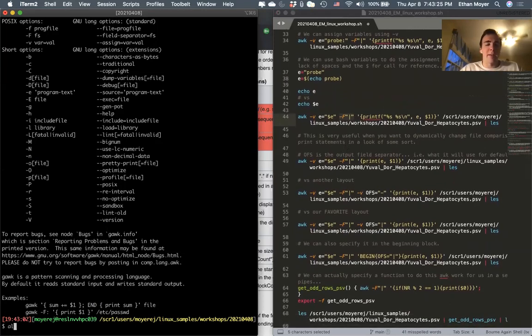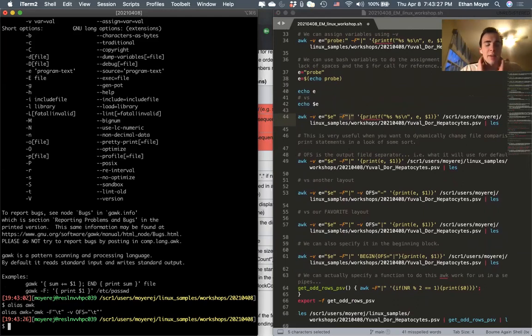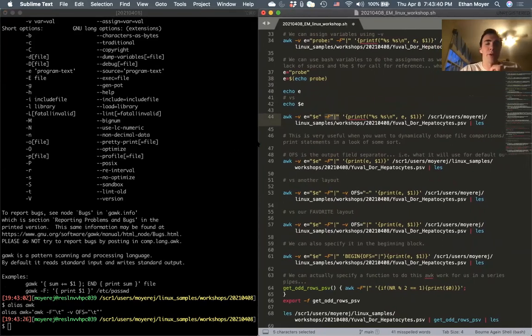So when we look back at the alias of AWK, that's set in Wanding's bash RC, and it was included in the lab HPC tutorial to copy that into your local HPC, or at least source it from your bash RC file. I can go into details about what that means later. But by setting that in your bash RC, which is just a file that sets up commands you want executed on login, it makes this an alias.